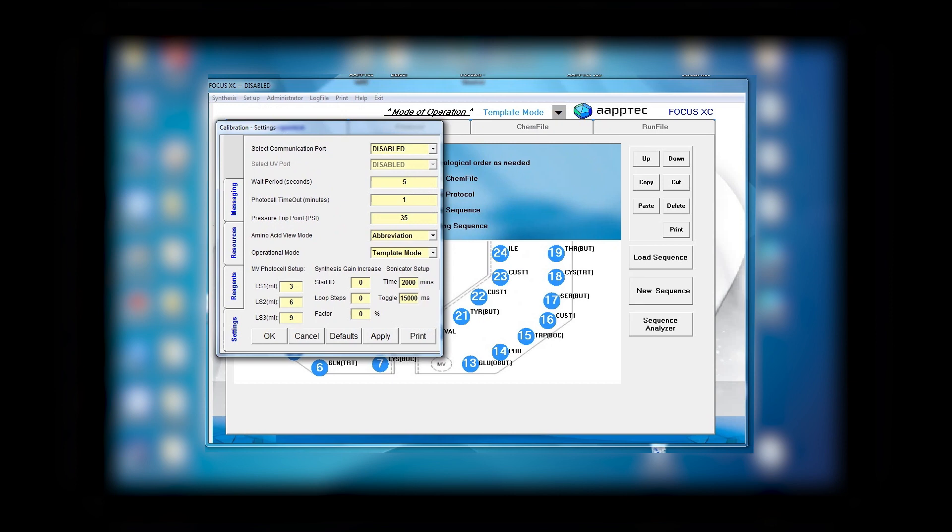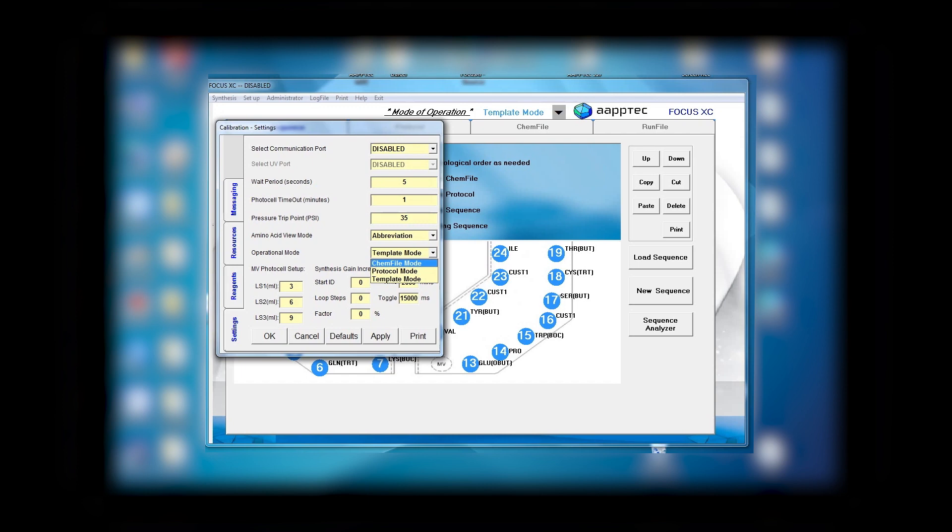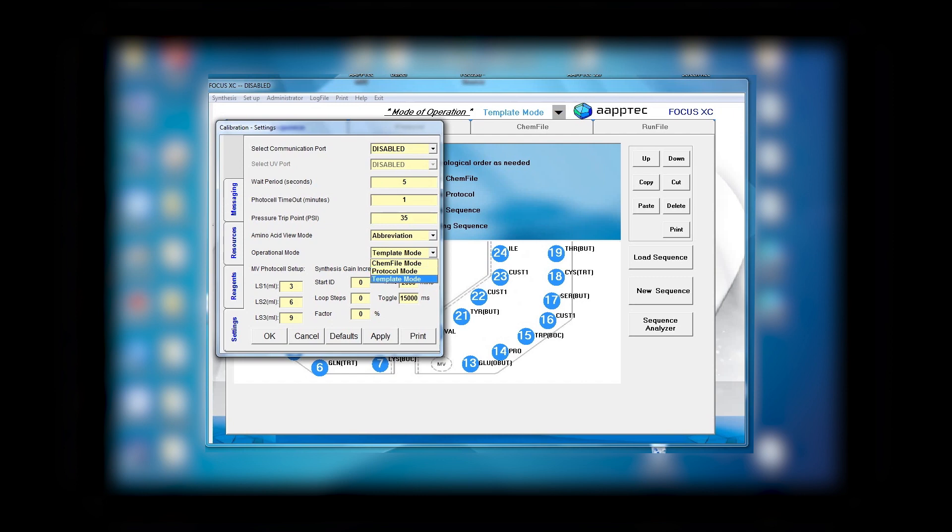The chem file mode is for when you only want to do one or two steps. Protocol mode is for when you want to write a totally new protocol and it gives you options to almost any chemistry that you wish. The template mode is one page and it is very simple to use.